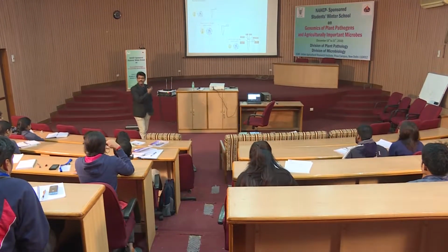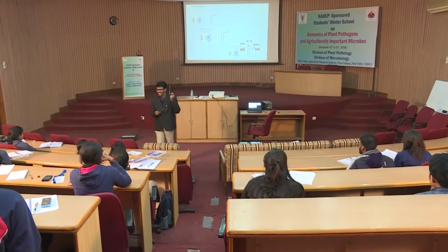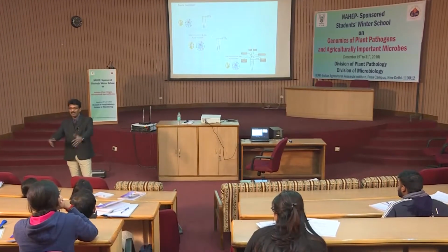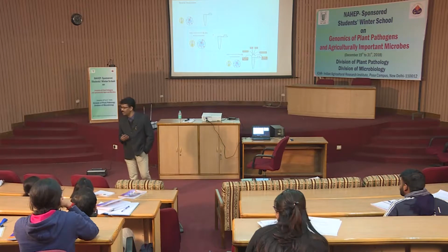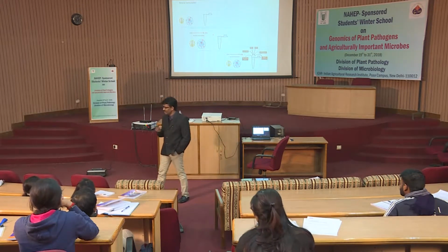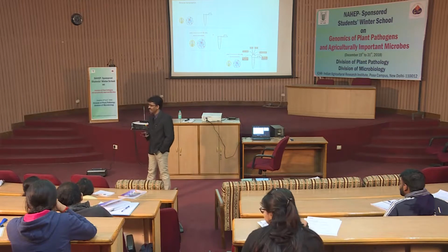One of the speakers told here, nanopore. It is adding 450 nucleotides per second. Just imagine what's happening there. Such a rapid addition of nucleotides, right? So your question is slightly linked to that only. As short as possible, and you should not mis-prime or mis-complement with some other region. It takes all the criteria of your primer design.